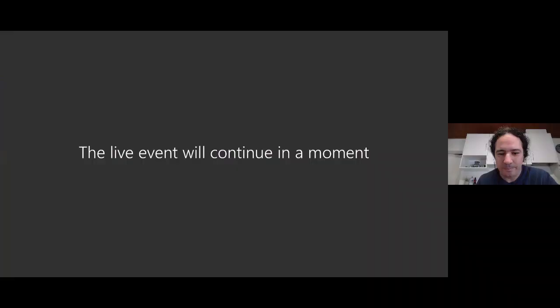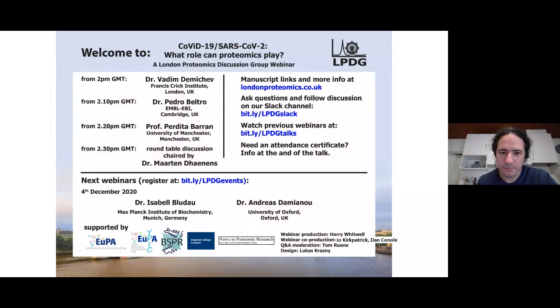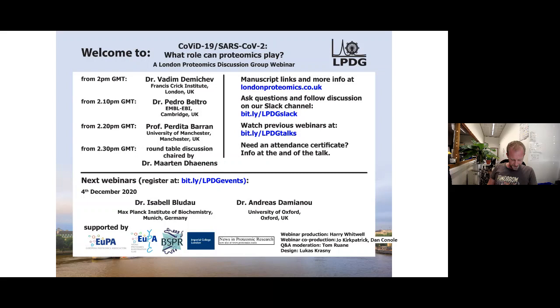Thank you. I see a lot of questions also heading Perdita's way. One that I'm also very fascinated about is the potential of mass spec to maybe, as one of the few fields, easily start including other pathogens while we're at it. You mentioned including flu, but just a remark that we might not be able to study this as easily as we want just because of corona, lockdown and a limited spread, if that is what the question was intending. So will we have enough flu this winter to see if you can include it?